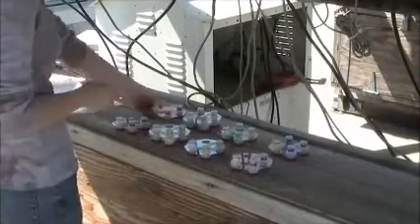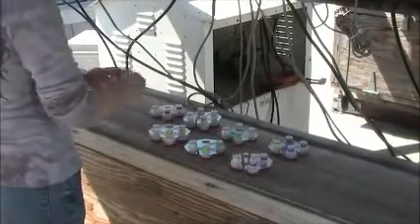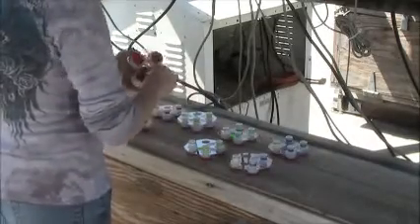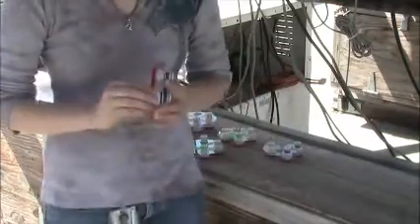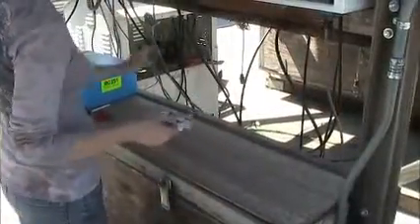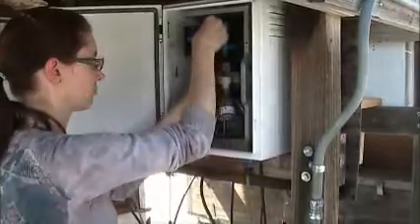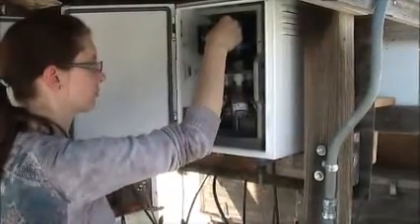Remove the Week 2 cartridges and transfer the third position cassettes into the empty hole in the Week 3 cartridges, making sure to put the removable cassette into the appropriate Week 3 cartridge. Remember that a twisting motion is helpful in installing the movable cassettes into the empty position. Place red caps over the Week 2 cassettes and return the Week 2 cartridges to their bag. Insert the Week 3 cartridges into the modules, making sure to orient the D cartridge properly.